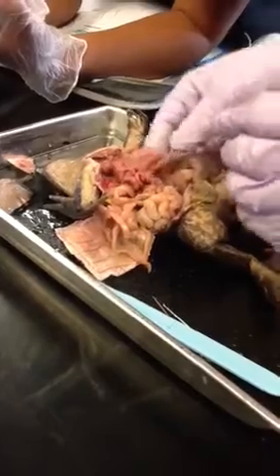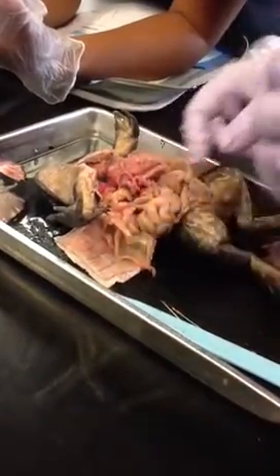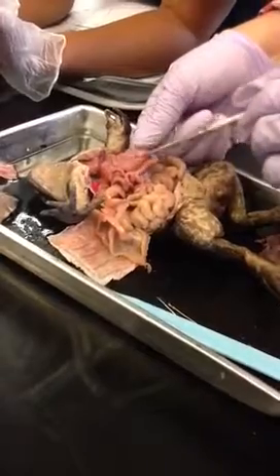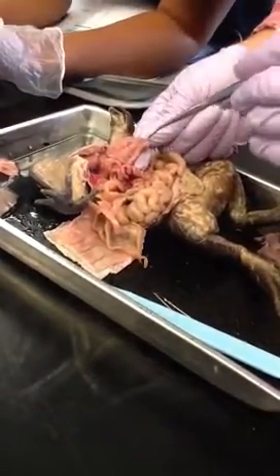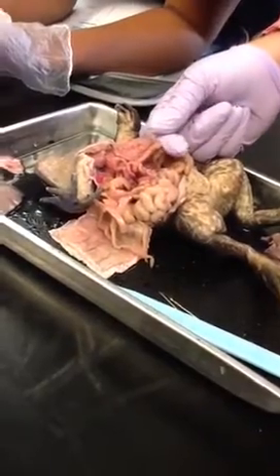This is her stomach. You can cut that open if you want to later on. Just make an incision down here. You see how many folds are in that stomach, like ours. Are they called like rugae? The rugae, the bumps, yes. And then we go from the stomach to the small intestine. This is all small intestine here, all around. Okay, and then the area right in here, that's going to be the pyloric sphincter.